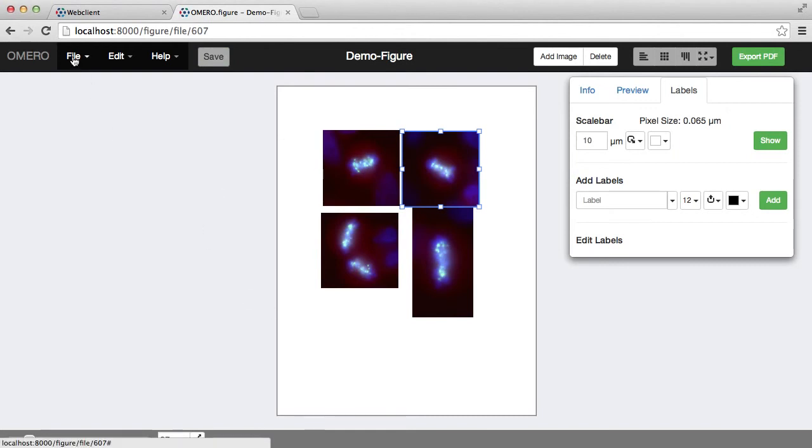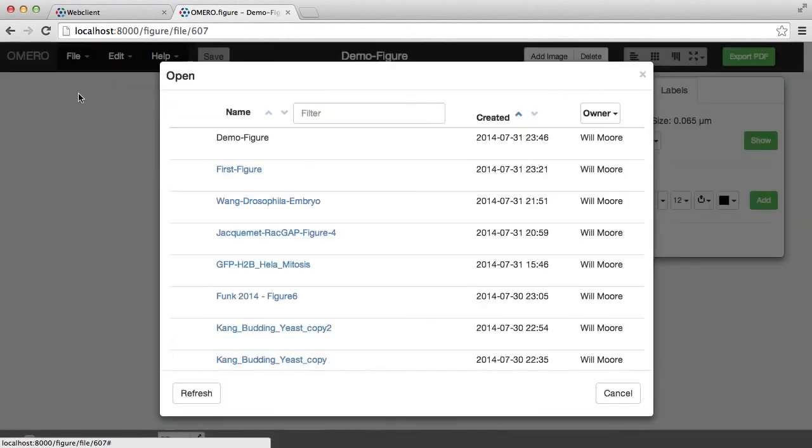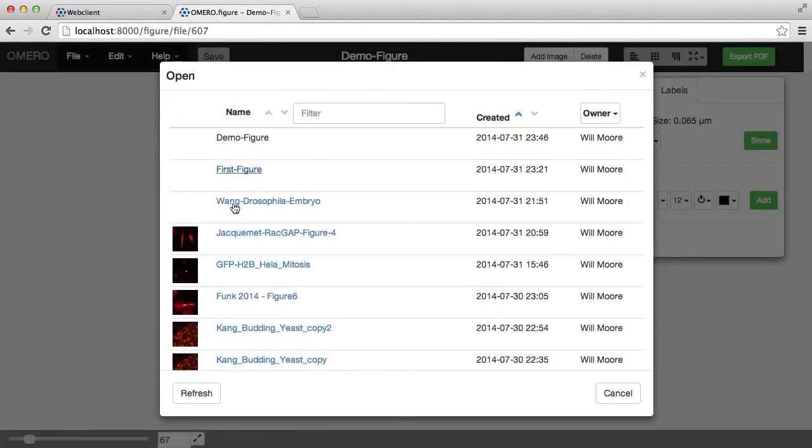This will be available in the file open menu, so I can open all files.